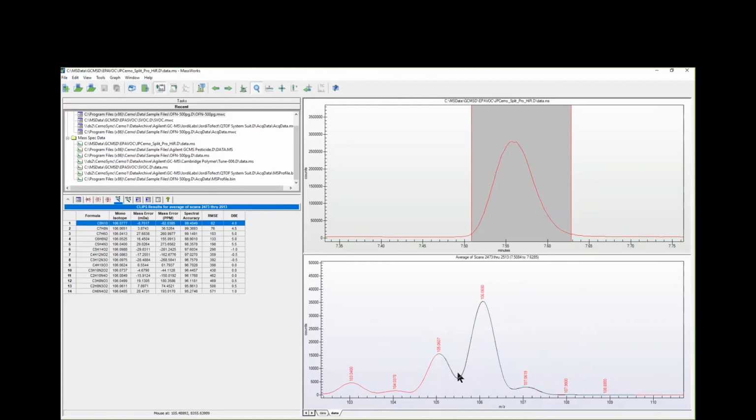Now it's taking into account the interference, and in fact it knows how much of the deprotonated species is there. That's your mixture result there. It's about minus a proton is about 17%, plus the actual molecular ion as well. So that's very important for GC MS applications.